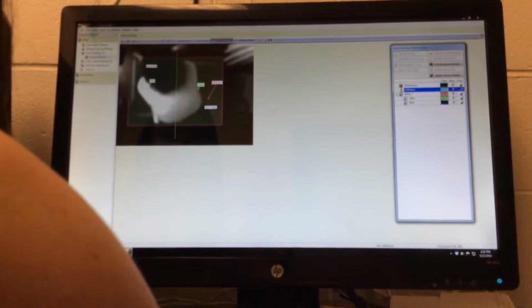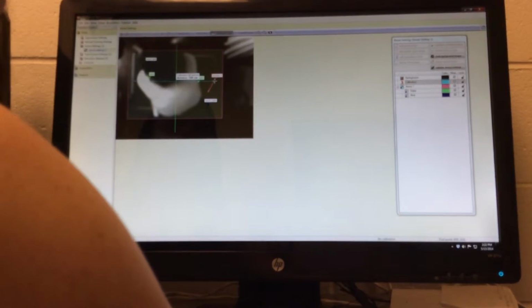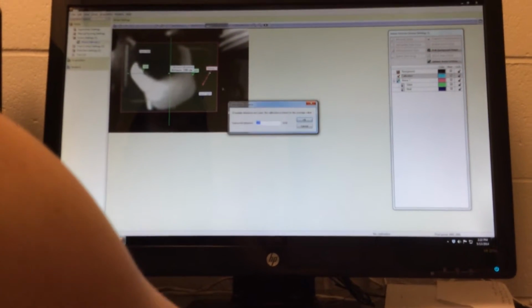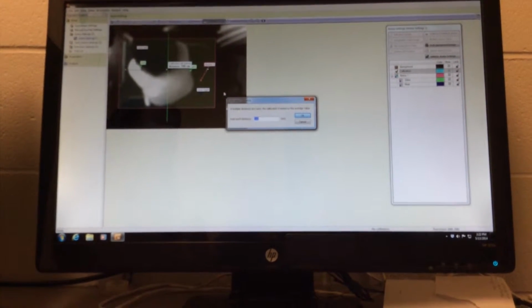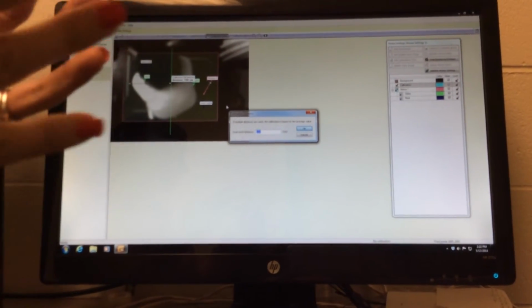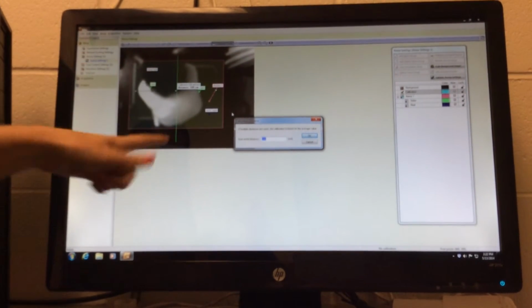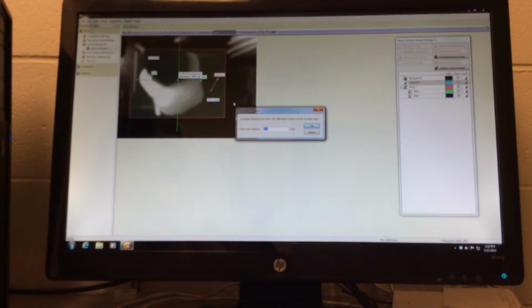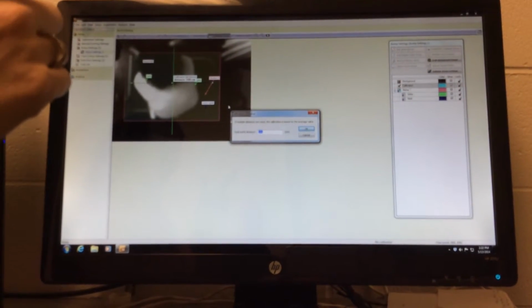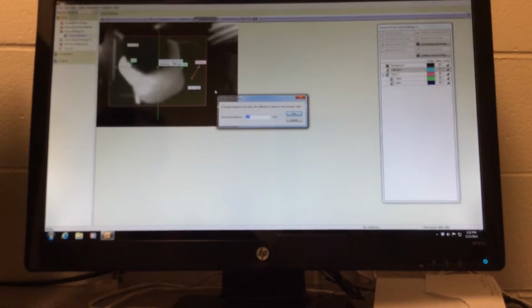So Abby, that video image is as big as you can make it, right? Not necessarily. You certainly want it to be large enough so that when you're seeing the animal, it's taking up enough pixels for the software to be able to make it out. With a rat, a distance like that, if this were on the floor, would be fine. You could zoom it in more if you wanted to, and if we focus this, my thought is it will probably zoom in a little bit more. But you don't need to be right on top.